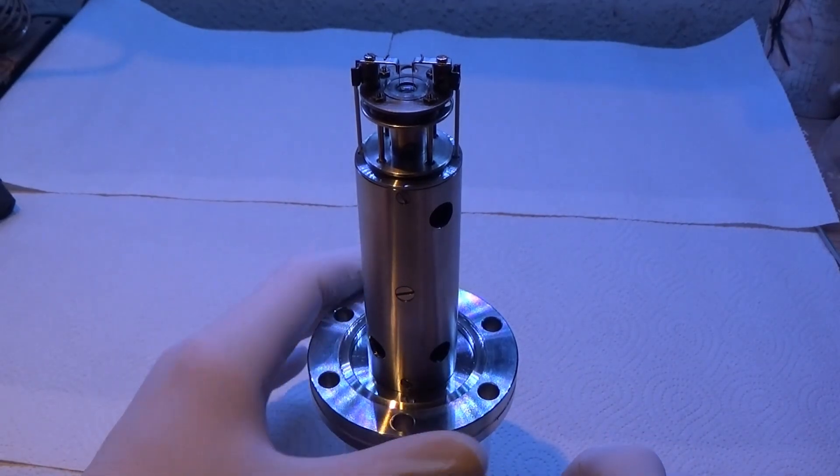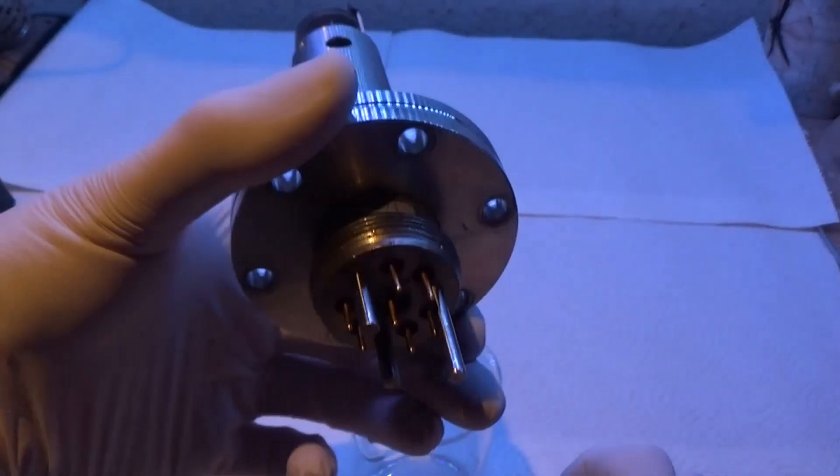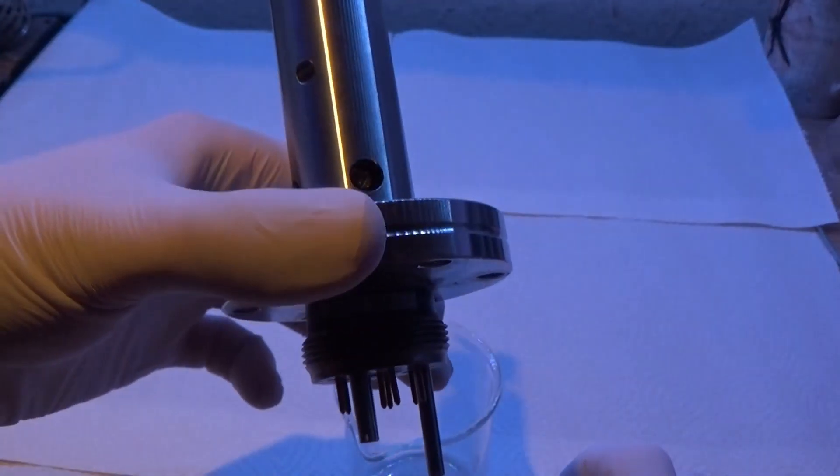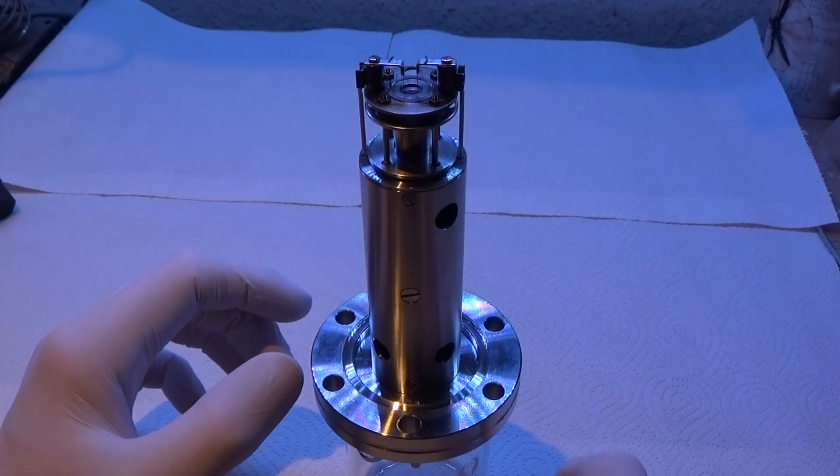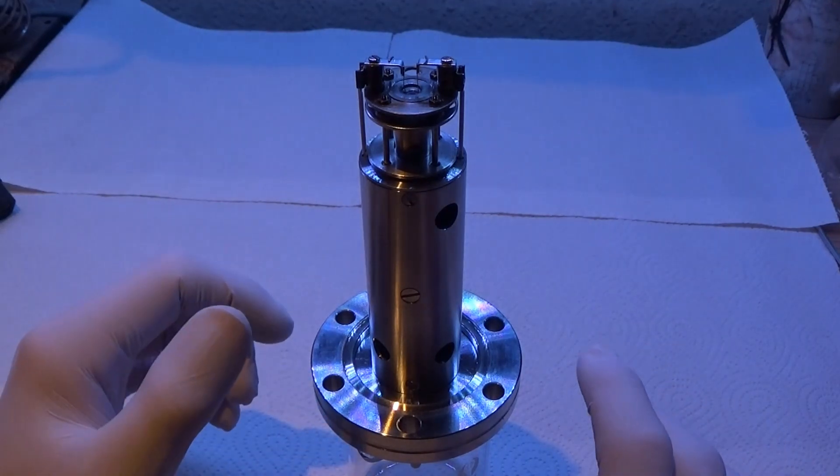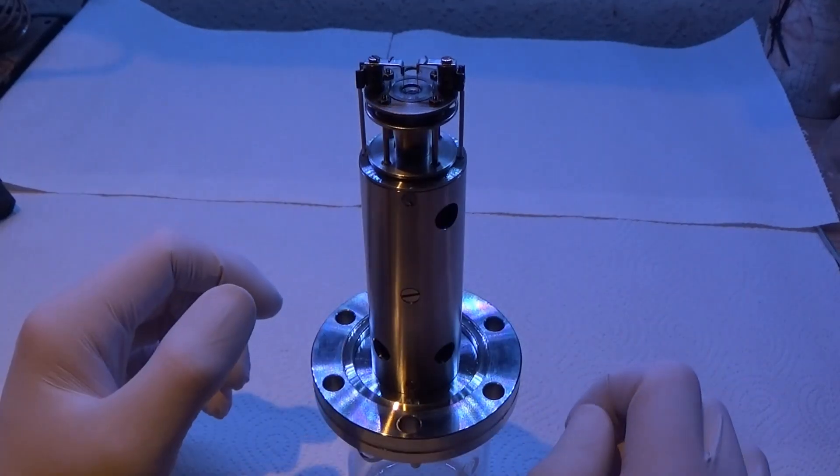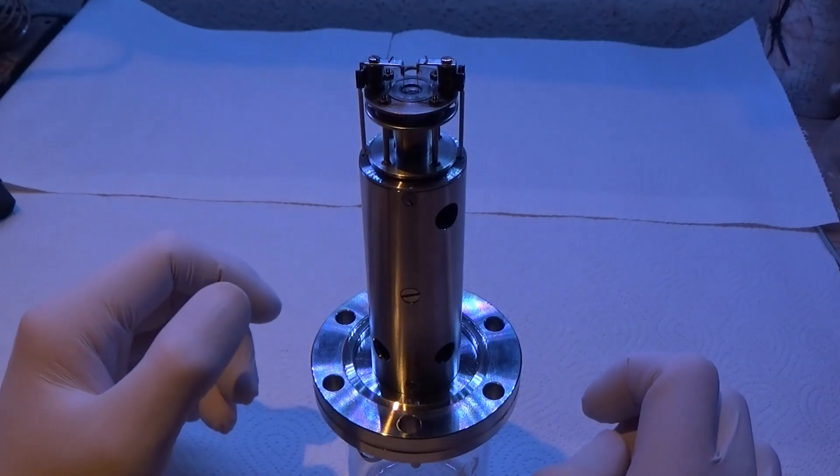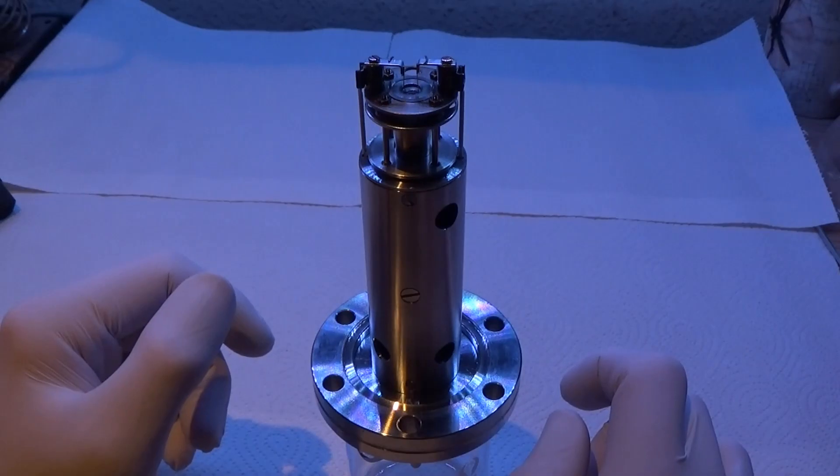This is a Balzers QMA 064, what is known as a residual gas analyzer, also known as an RGA. It is a real mass spectrometer, albeit a tiny one, but it's usually used specifically for diagnosing vacuum systems. They do also have roles in research as small, cheap mass spectrometers for atmospheric analysis, typically.